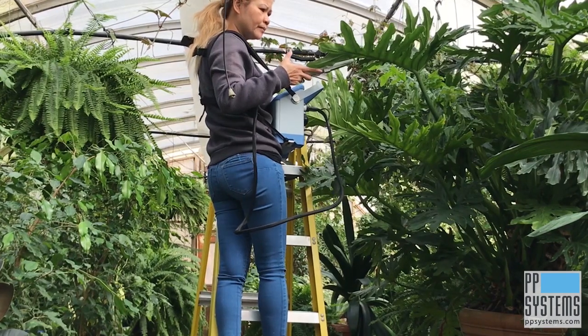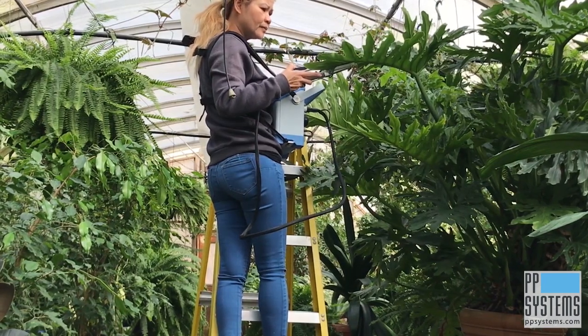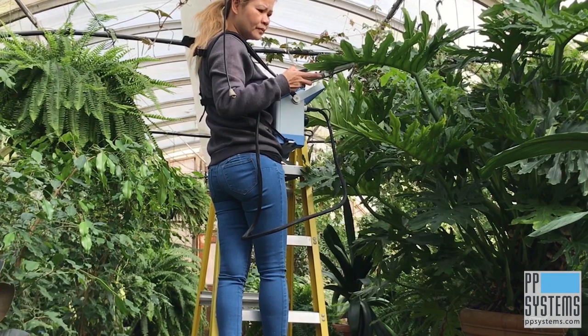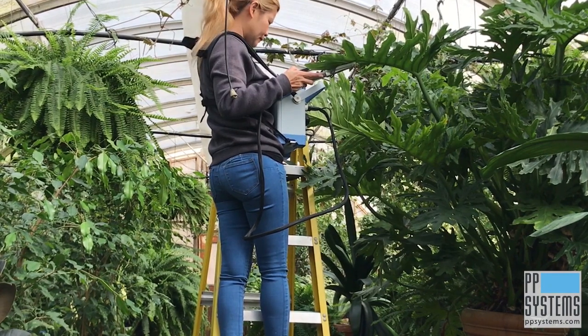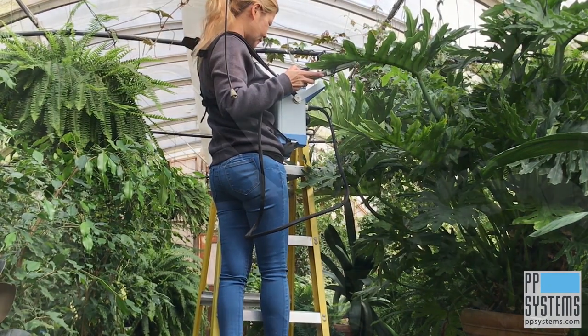When it comes to field research, size and weight matter, and at just over 4.5 kilograms for the console and under 1 kilogram for the cuvette, the Cyrus 3 is the most portable photosynthesis system of its kind.